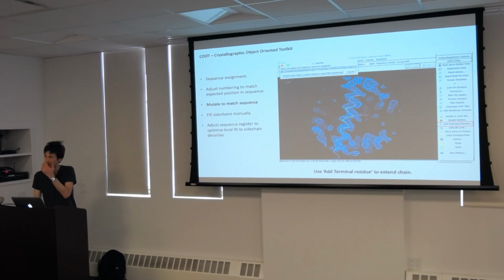So, I don't know if you're going to go through it later, but how about model refinement with EM maps? So yeah, that's the next step from here. Essentially, you build an initial model. You need to refine it versus the map and iterate. Correct? That's right. I'm not really covering that in a great deal of detail.